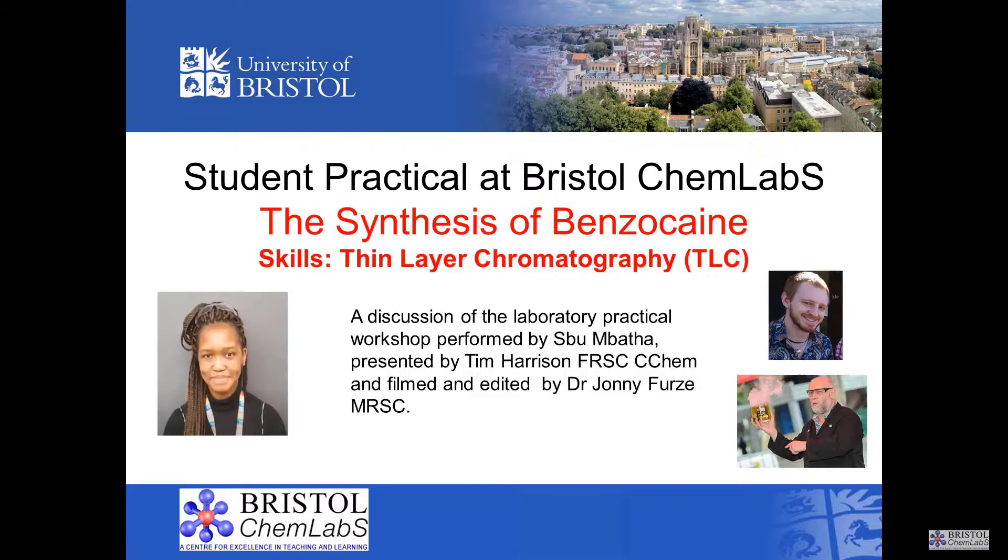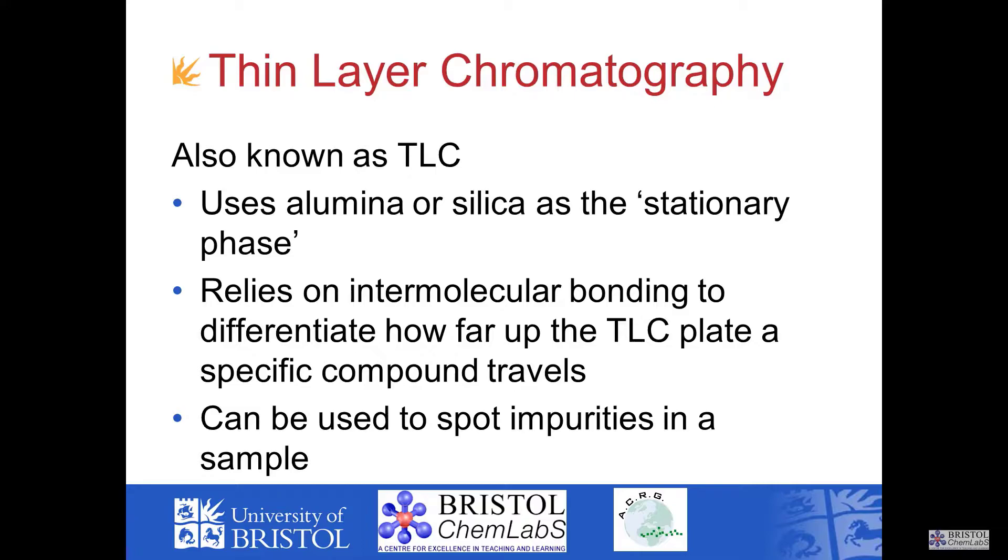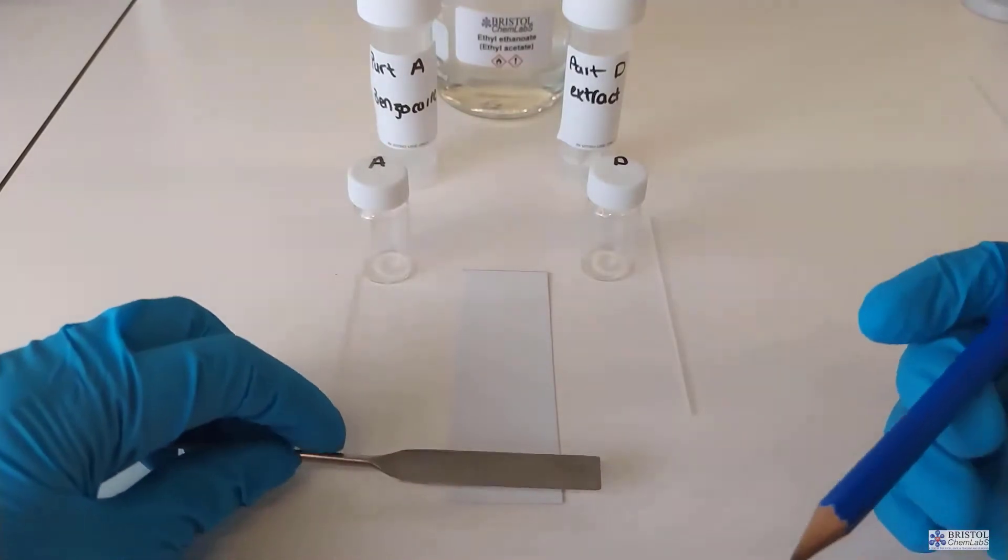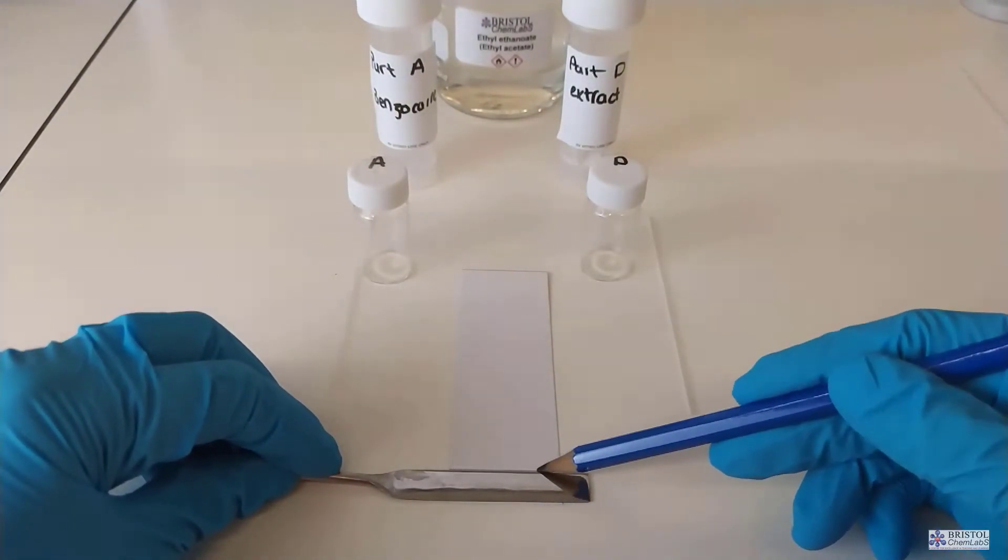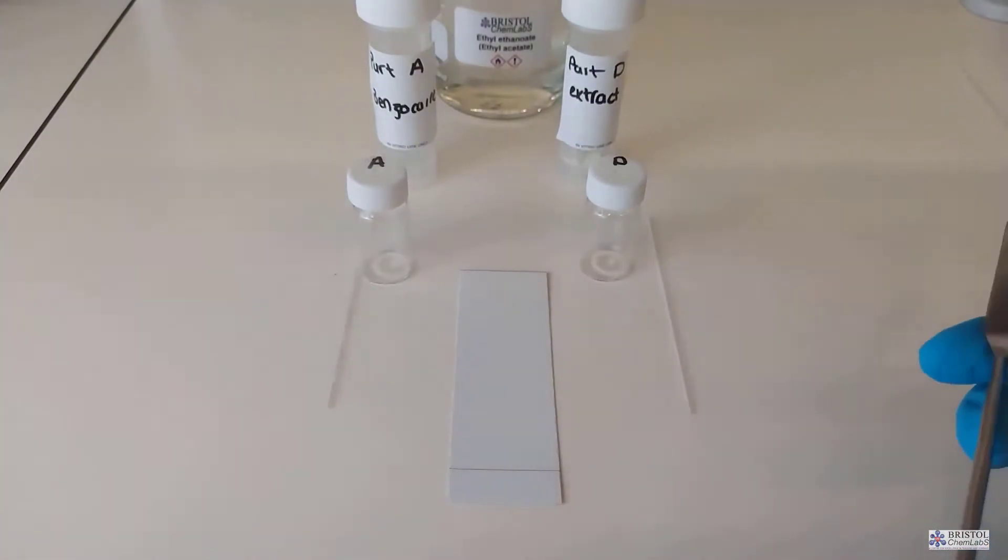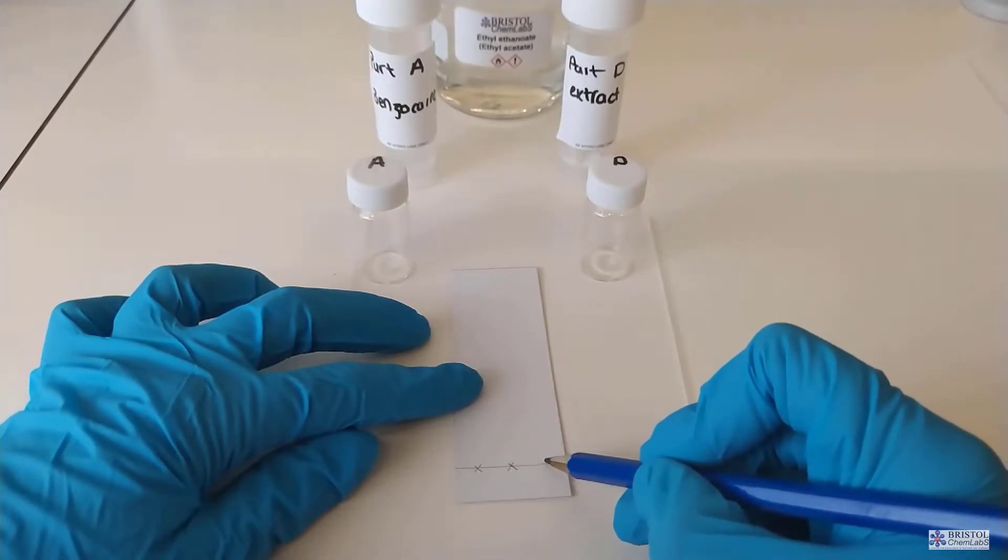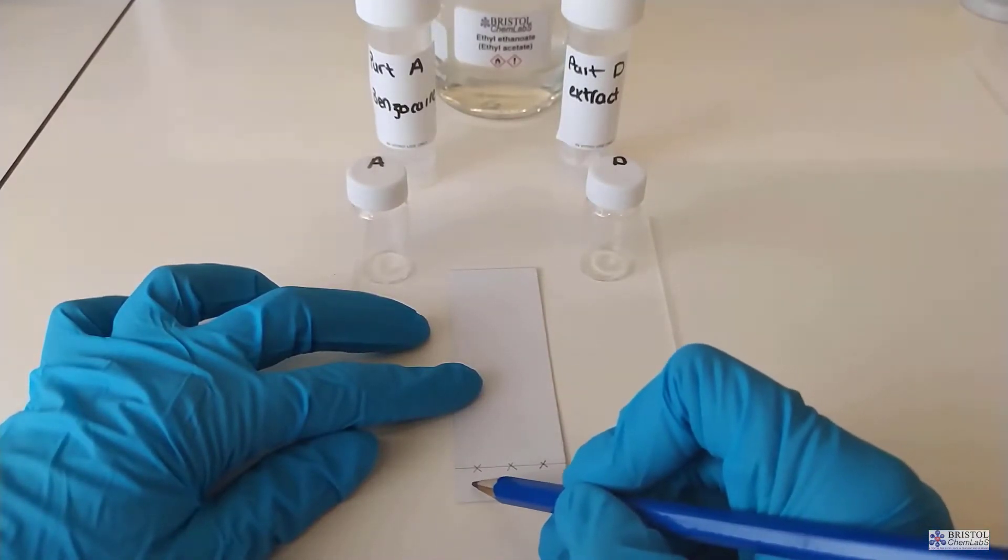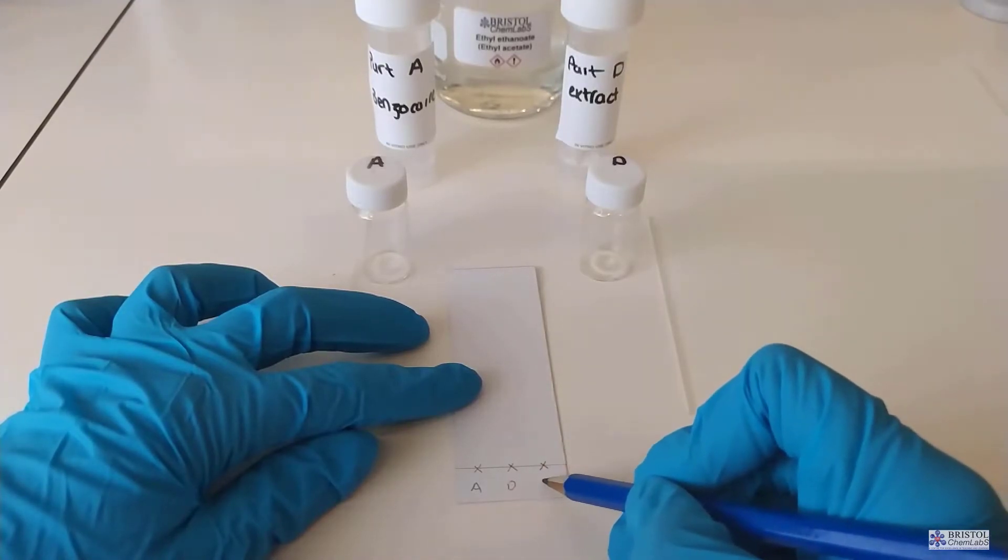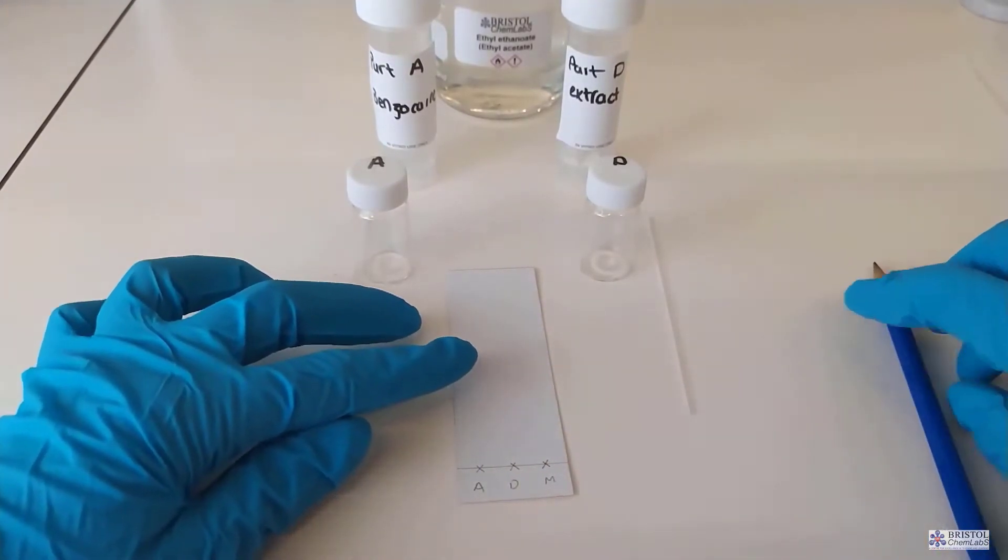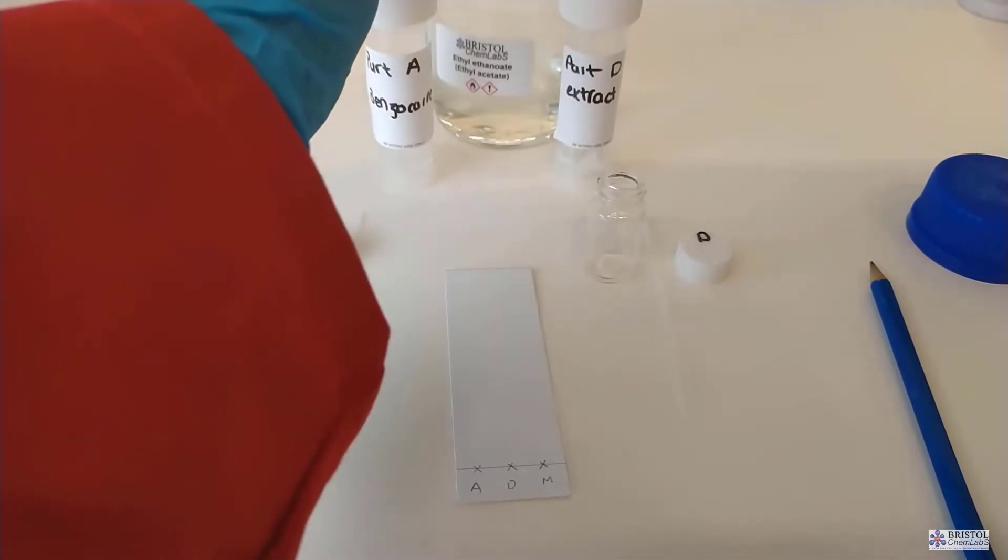One way of looking at the purity of the product formed in this synthesis is to use thin layer chromatography which gets abbreviated to TLC. The TLC plate that is used contains alumina that has been treated with a fluoresce. The alumina itself is stuck either on the back of a plastic or aluminum support material. When handling a TLC plate it's best to hold it by its edges so you don't transfer any contaminants to the face. To mark up a TLC plate pencil not ink pen must be used.